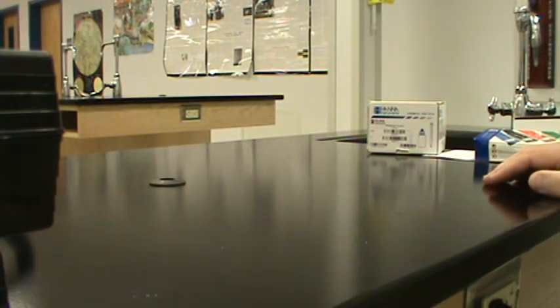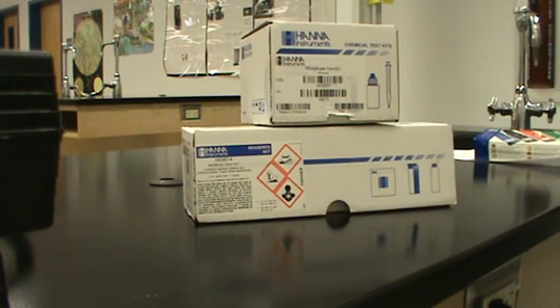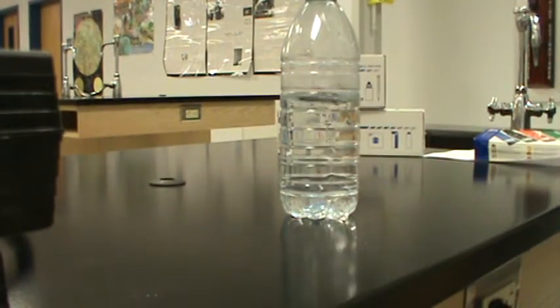I will be doing these experiments. I'm going to start with nitrates and phosphates, because these I can do together. We're going to be using a sample of water. Here's our water sample. Now, we've already done some tests on this using the sixth graders in the lab. This water sample comes to us from one of our students near Dexter, New Mexico. This comes from an irrigation well on their property.